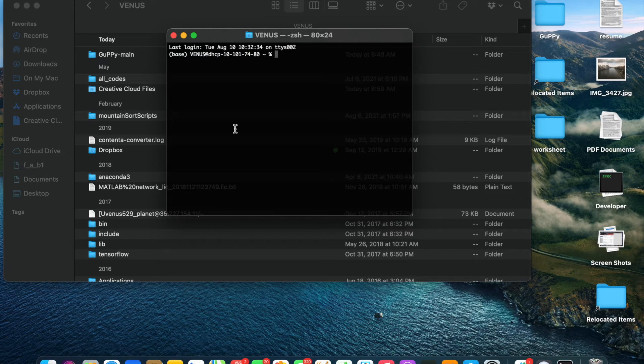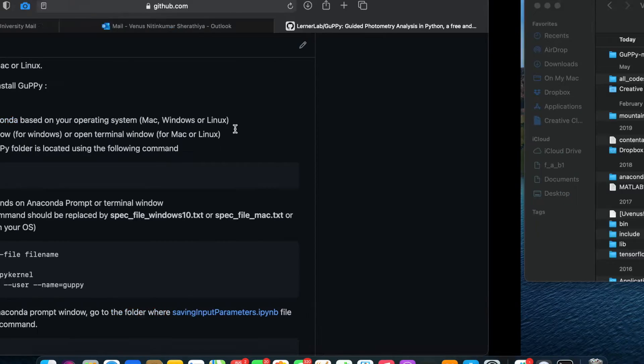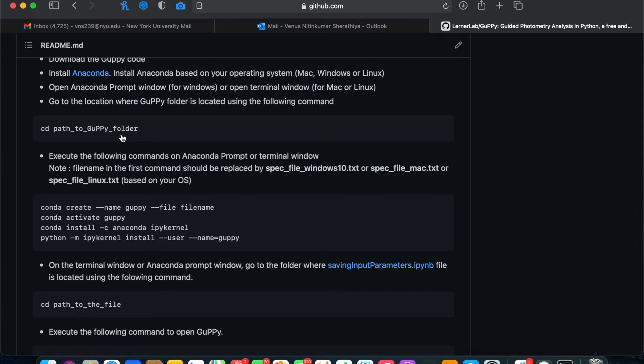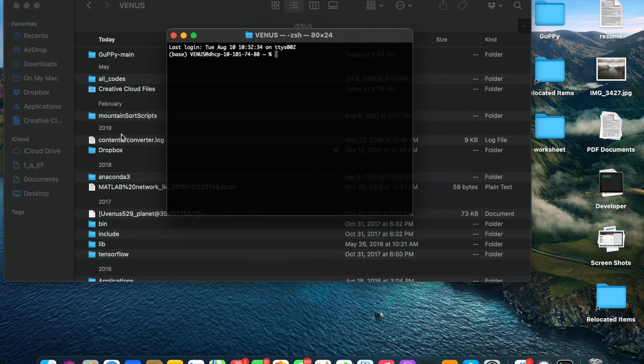Now, again, you're going to follow the instructions. First, you're going to direct to where you've put your Guppy folder using the cd command.